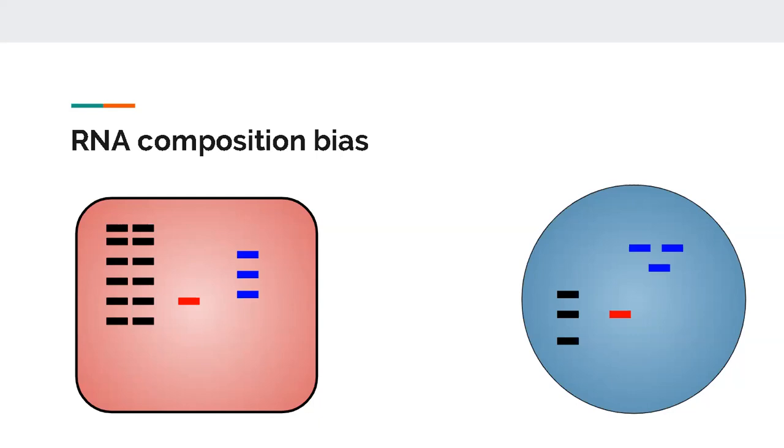you end up picking up more than others? The black one. Yes, yes. So the black one. Just because the number of transcripts was much higher, in your final sample you might end up picking up black transcripts more than the others.